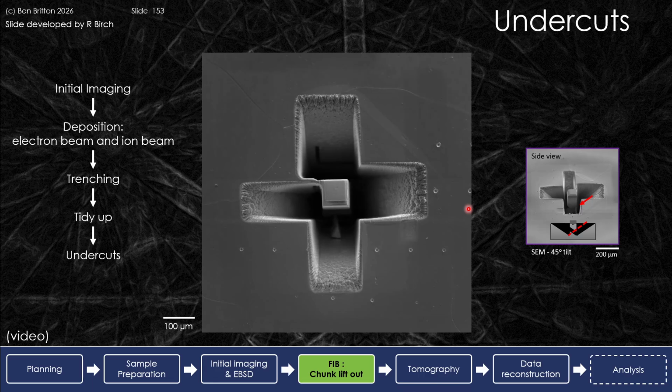there's the cut. Now here we were a bit too fast, and so we actually had ejection of a bit of material. It was out of the way of our experiments, but that wasn't ideal. So that's a little bit of debris that's not there. But we now effectively, that's come off because we've cut off this little bit of material. We now have a freestanding object, except it's on this little edge, a little tab we call it, and now we have that object.